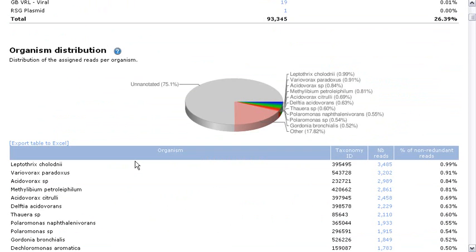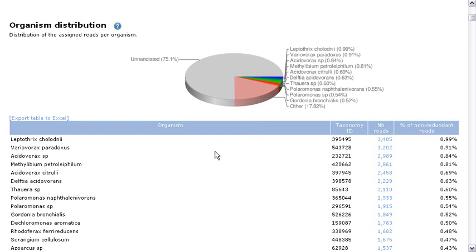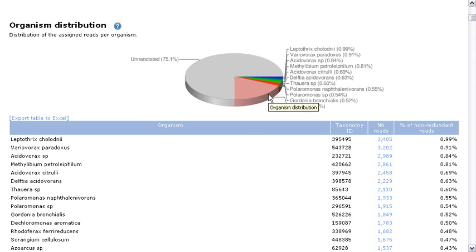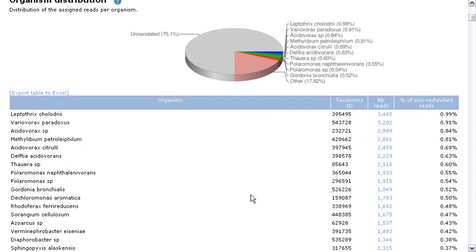And if I keep scrolling down, you will notice this pie chart telling you what are the 10 most expressed organisms in this sample, as well as the comprehensive list of organisms right here with their taxonomy ID and the number of reads for each.